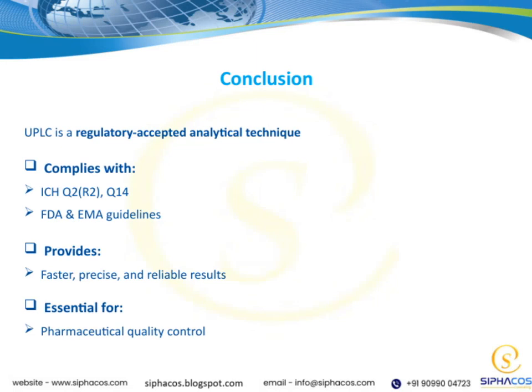So, to wrap things up, UPLC is a regulatory-accepted analytical technique, meaning it's recognized and approved by major health authorities. It complies with important guidelines like ICH Q2(R2) and Q14, as well as FDA and EMA standards, which ensures its reliability and acceptance in the industry.